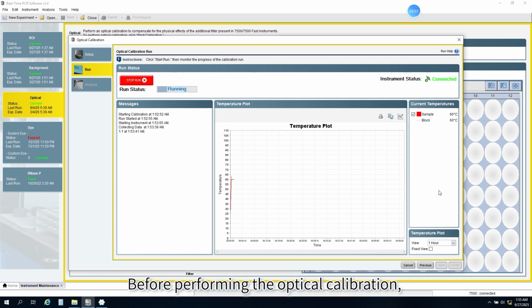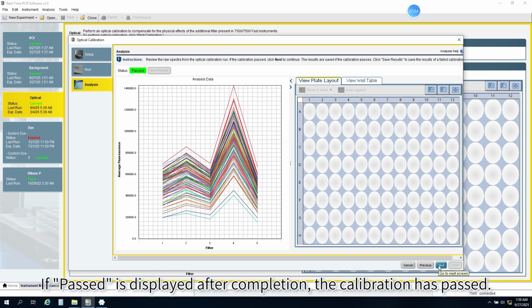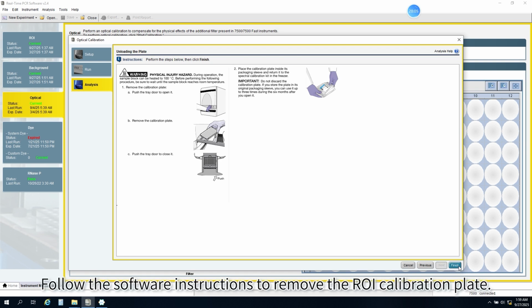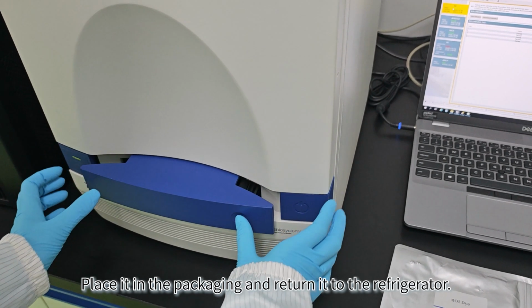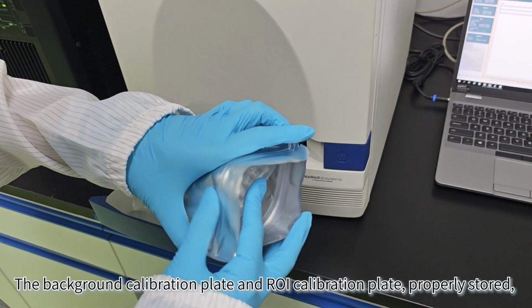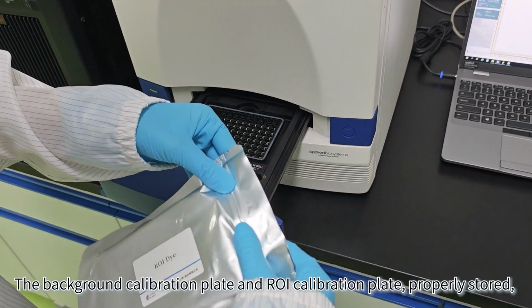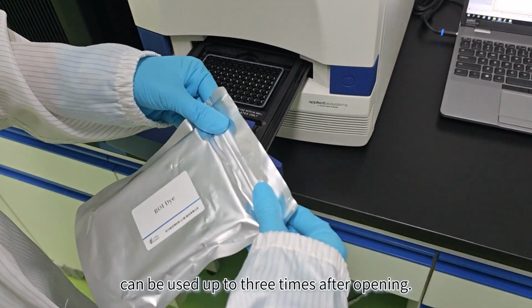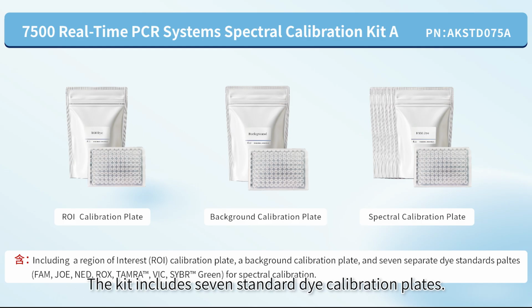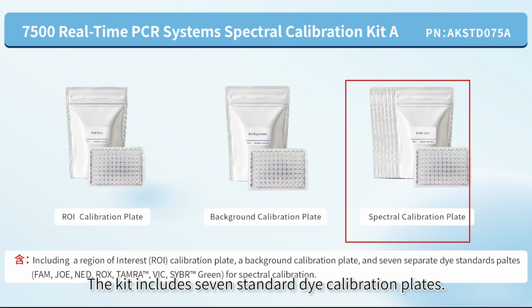Before performing the optical calibration, ensure the block has cooled to room temperature. If Passed is displayed after completion, the calibration has passed. Then click Next. Follow the software instructions to remove the ROI calibration plate. Place it in the packaging and return it to the refrigerator. The background calibration plate and ROI calibration plate, properly stored, can be used up to 3 times after opening. Finally, perform dye calibration. The kit includes 7 standard dye calibration plates.